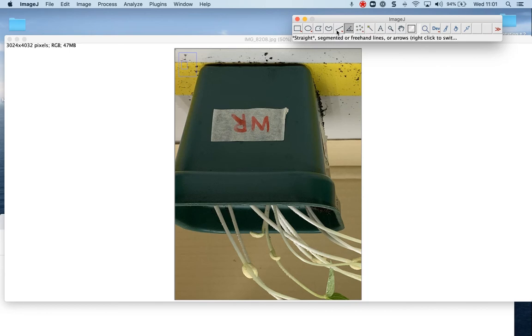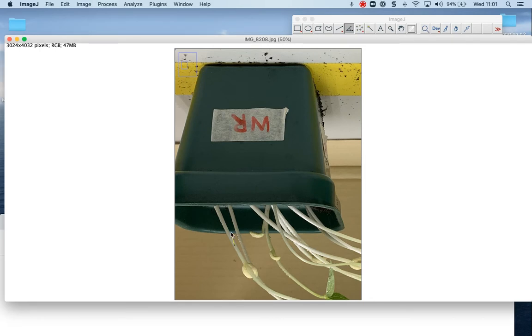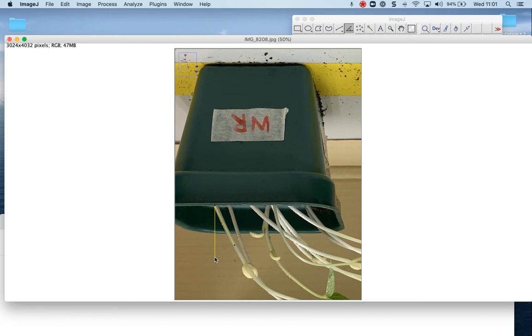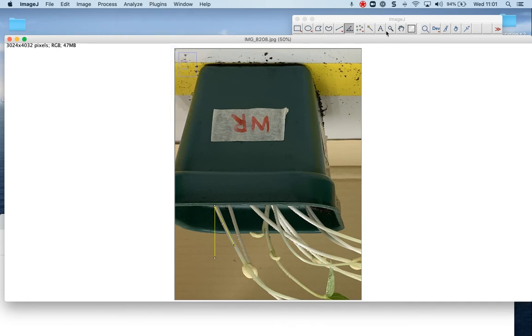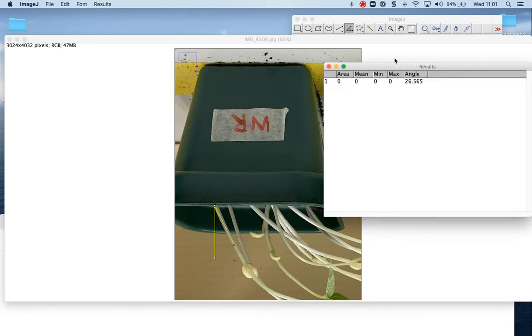So what I'm going to do is I've clicked on the angle tool here. First thing I want to do is I want to click on the stem. I'm just going to kind of follow that down to the top of the pot. And then I'm going to click again. And then I'm going to pull that out into a straight line. So basically what it's measuring is the angle right here. So I'm going to go to analyze, measure, and it'll pop up here with the angle.